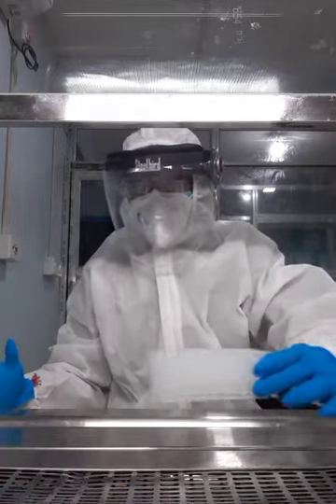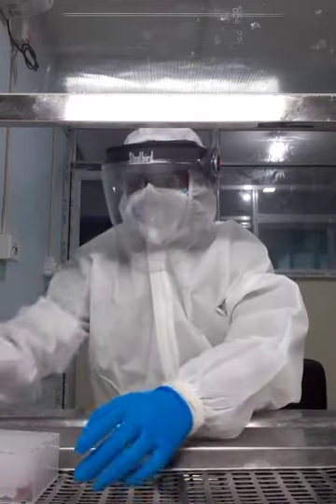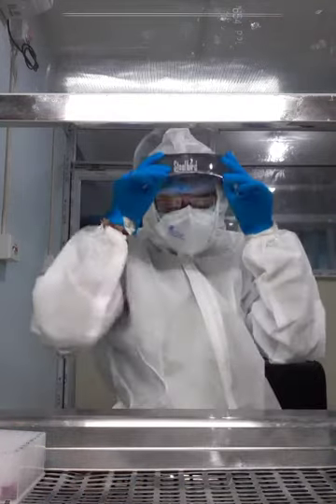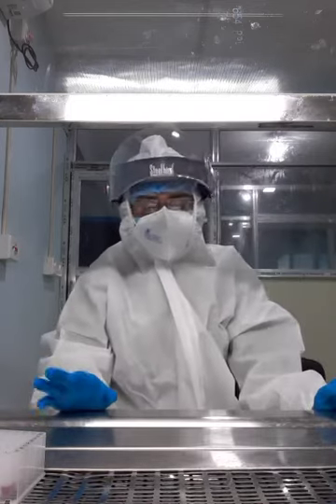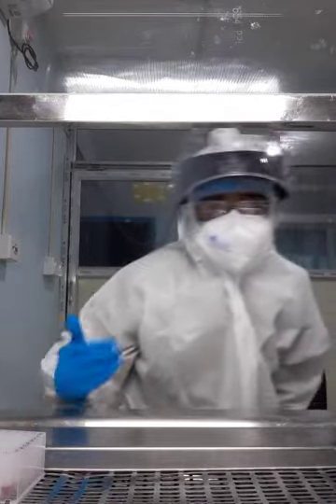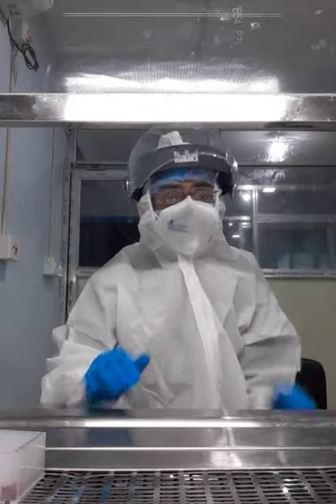Now just safely place the deep well plate on the other side of the biosafety laminar, so that there is no contamination from the VTM sample. Now it's time to put the VTM sample inside the biosafety cabinet.